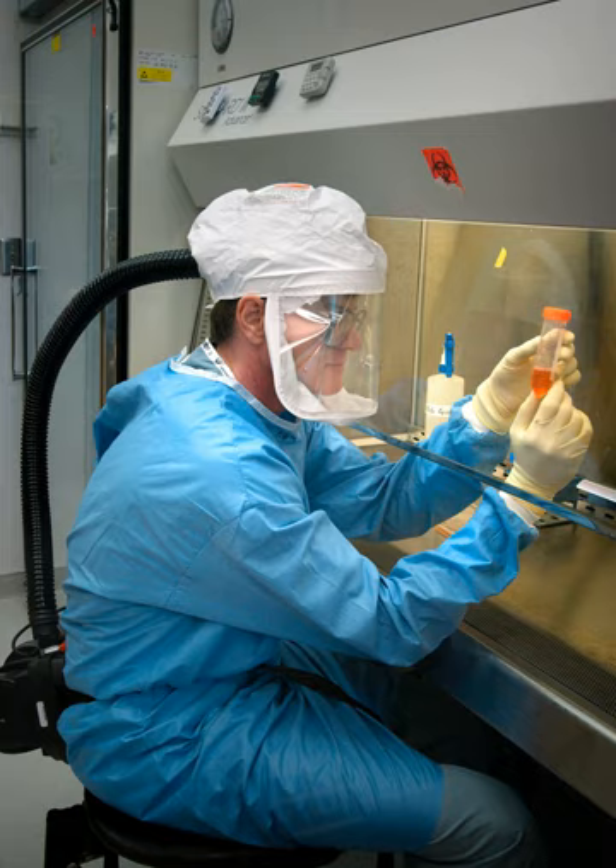Changing the filter should be limited to trained persons as the filter is potentially contaminated. This can be done either after the cabinet has been decontaminated using a gaseous procedure — using formaldehyde, chlorine dioxide, or vaporized hydrogen peroxide — or a bag-in, bag-out procedure. When a UV light is used, this lamp should be checked and changed as well. UV lights decrease in power over time, resulting in diminished disinfection of the working area.